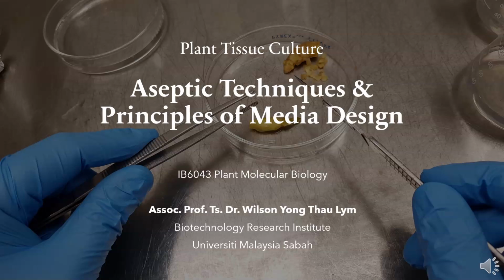In this session, we will explore the fundamental aspects of plant tissue culture, including aseptic techniques, crucial for preventing contamination, and the principles of media design that support optimal plant growth and development. Let's dive in to understand these core concepts that form the foundation of successful plant tissue culture practices.